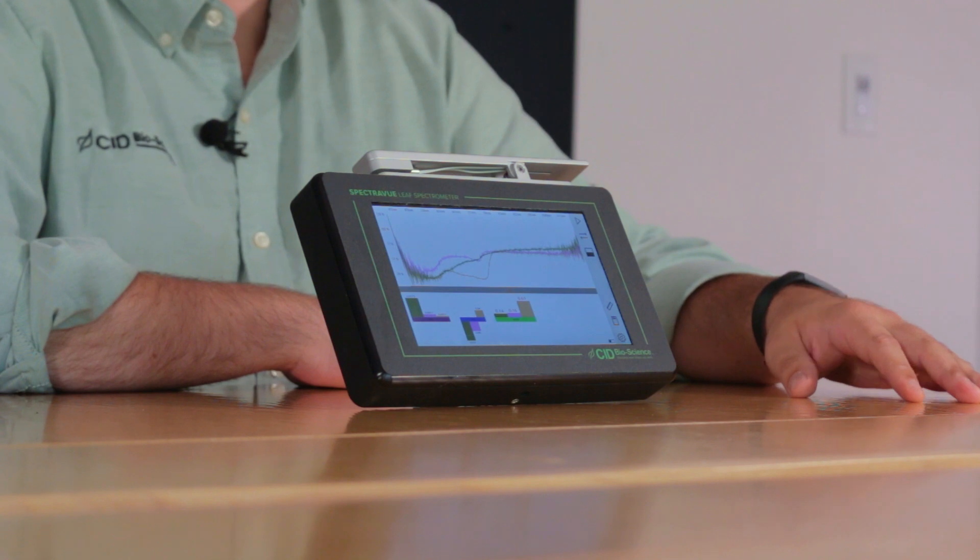The SpectraView is a portable and field-ready leaf spectrometer that is useful for anyone from agronomists to plant physiologists, horticulturists, or even classroom education. The instrument is capable of taking absorbance, transmittance, and reflectance measurements all with a single scan.